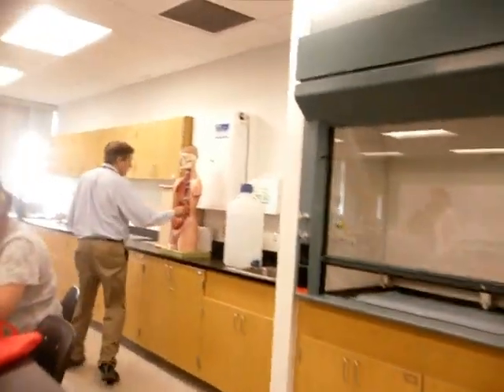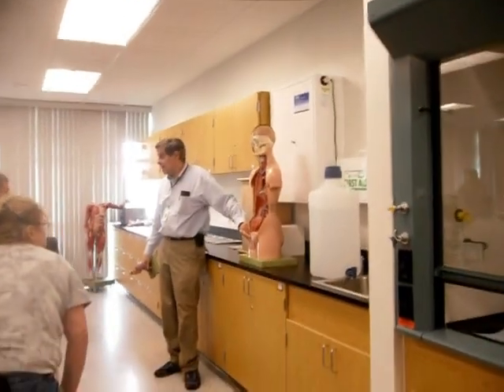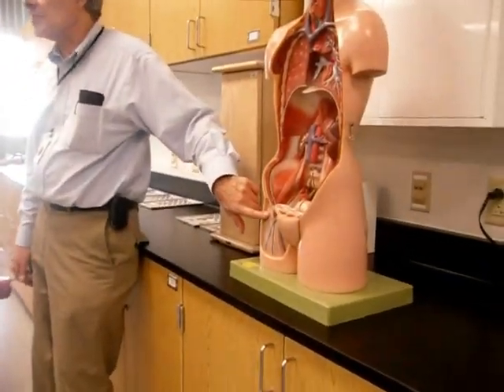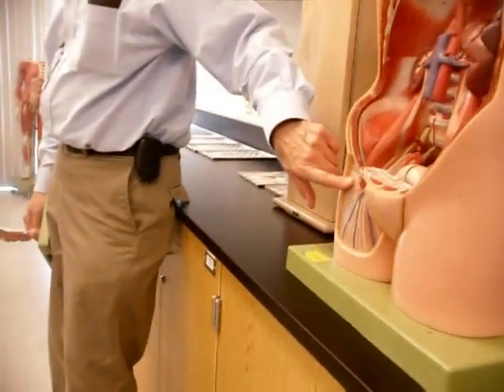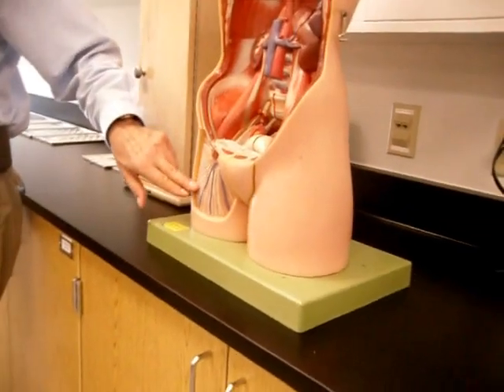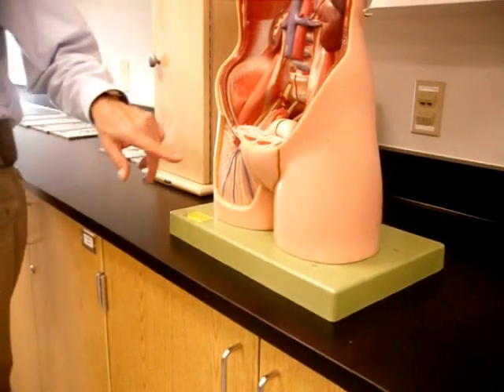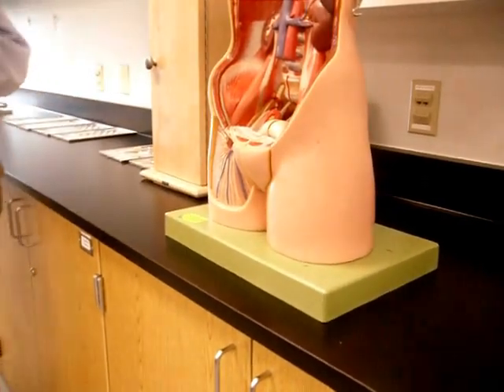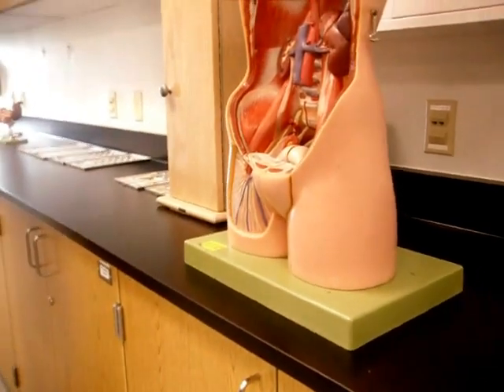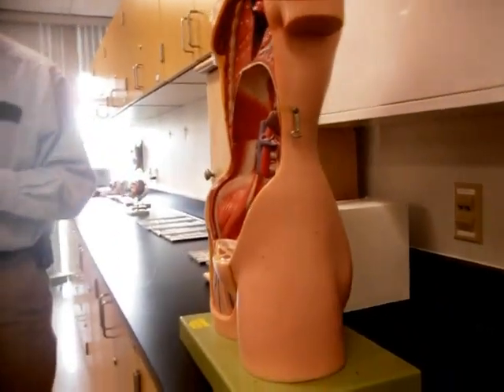Right here. You can also see down here in the leg these little pink globes. What are they? Lymph nodes. Which ones? Inguinal, right. Inguinal lymph nodes, and the white lines here are lymphatic vessels. Lymphatic vessels feeding into the lymph node are what? The afferent lymphatic vessels. And those draining the lymph node? Efferent. A before E. Think of efferent as exiting, E for exit. Exactly. Good way to remember.